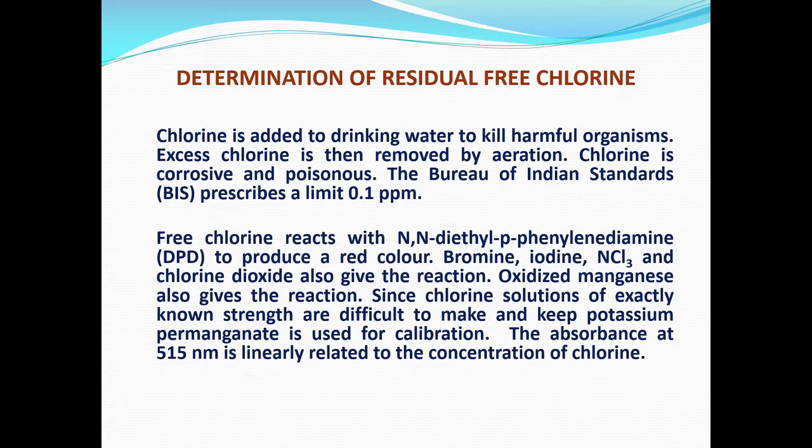And now we move on to the determination of residual free chlorine. This is a fairly important method, because free chlorine is usually added as a disinfectant in several wastewater treatments, especially even for municipal wastewater.